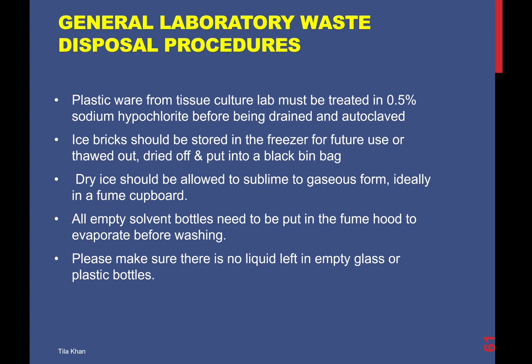These are some general laboratory waste disposal procedures that we must follow while working. So plasticware from tissue culture lab must be treated with sodium hypochlorite solutions before being drained and autoclaved. Ice bricks should be stored in the freezer for future use or thawed out or dried off and put in a black bin bag. Dry ice should be allowed to sublime to gaseous form, ideally in a fume hood. All empty solvent bottles need to be put in the fume hood to evaporate before washing. Please make sure that there is no liquid left in empty glass or plastic bottles.